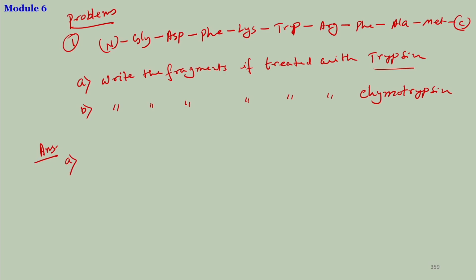What will happen if you treat it with trypsin? It will cleave the peptide bond at the C terminal position of wherever there is a lysine or wherever there is an arginine.